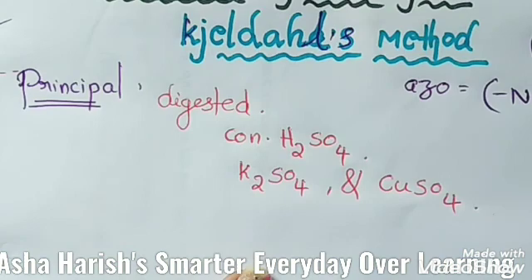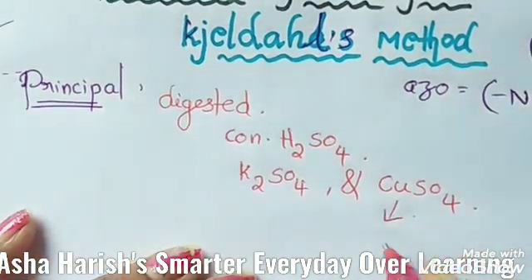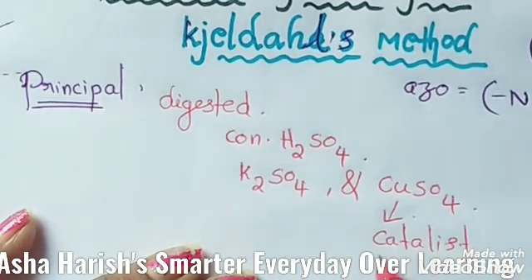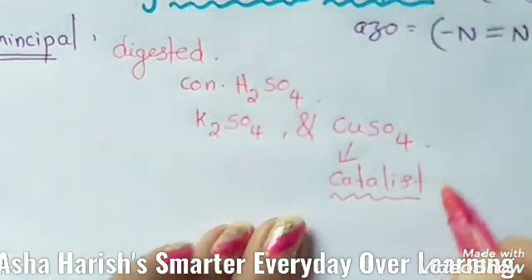These you have to take in a Kjeldahl flask. Here copper sulfate is acting as a catalyst, which means it is not directly participating in the chemical equation.